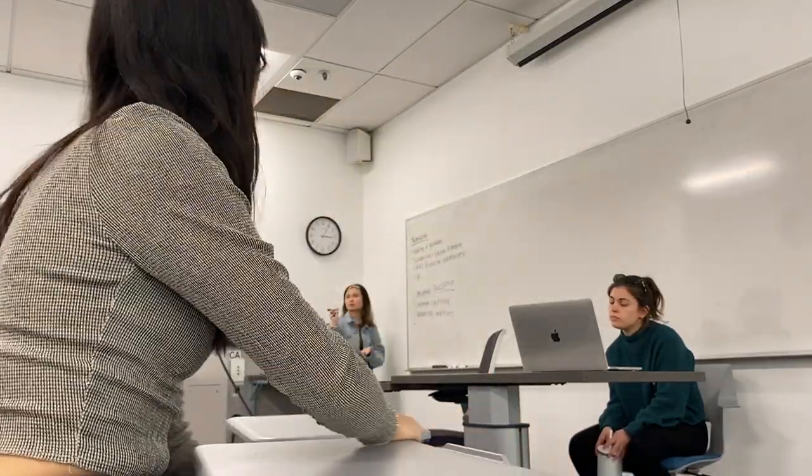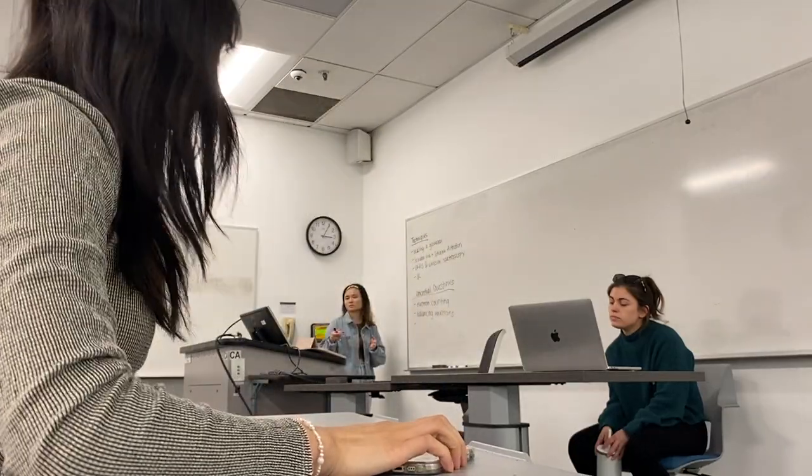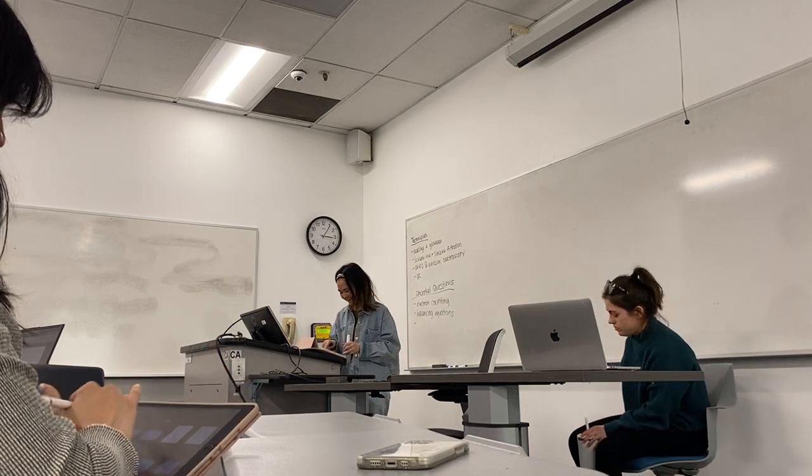So I said that you don't actually have to use it in the practical. It wouldn't be realistic for us to ask, when do you press the pedal and raise the pressure, lower the pressure. You should know conceptually what goes into loading a glove box and taking things out. Okay. Well, I'll be going over that, so I guess that's the first thing I can go over.